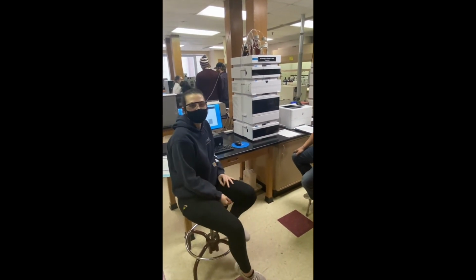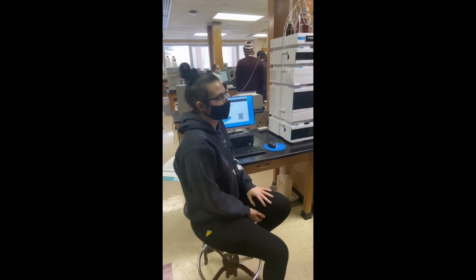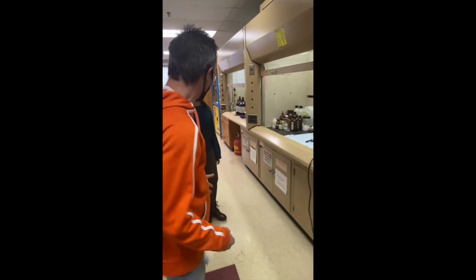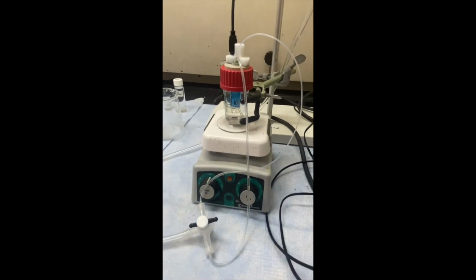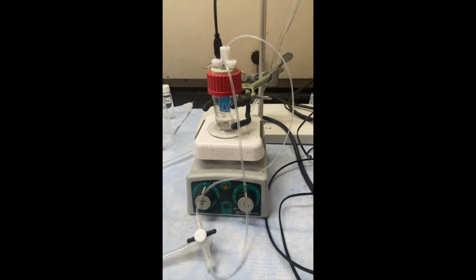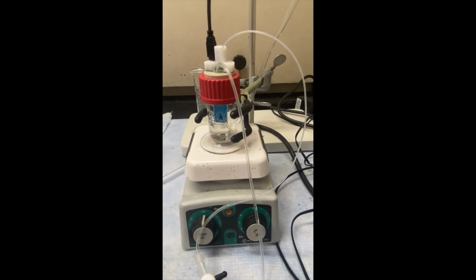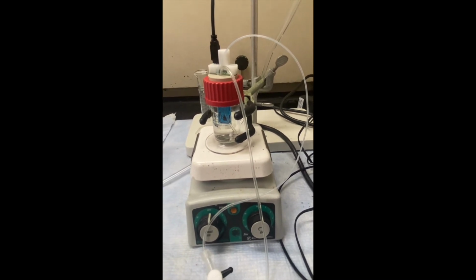So we are looking at finding different metals in our samples, soil samples, particularly looking for copper. So here's another group of students working on the same soil samples. Christina, tell us what this is. This is electrochemistry. We put an electrode inside a sample that we took all the oxygen out of, because the oxygen will react with the metals. So is this something you do to monitor river water or soil? Is it just soil samples? Yeah, it's a soil sample that we diluted.